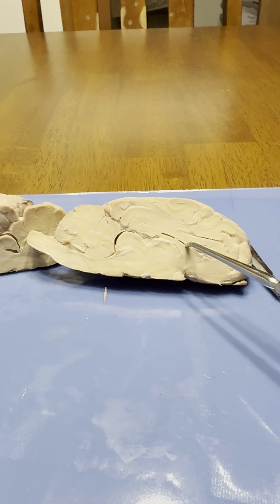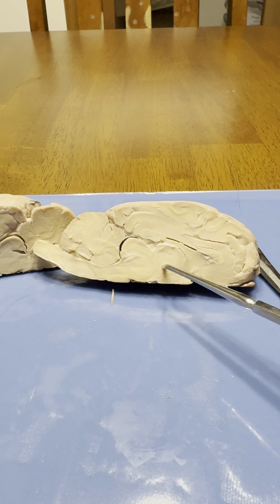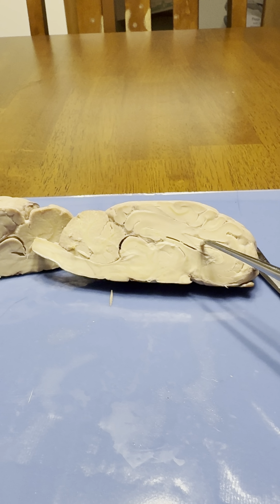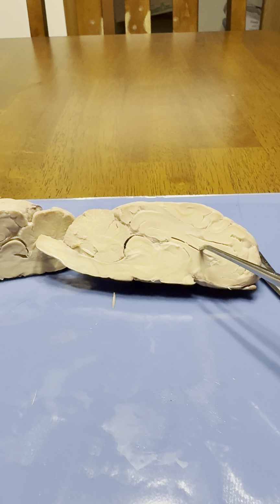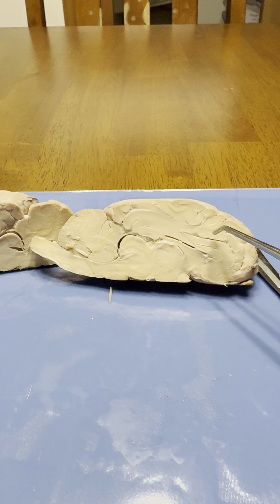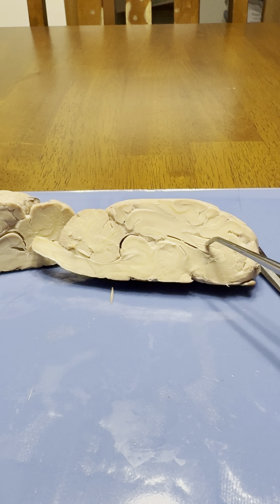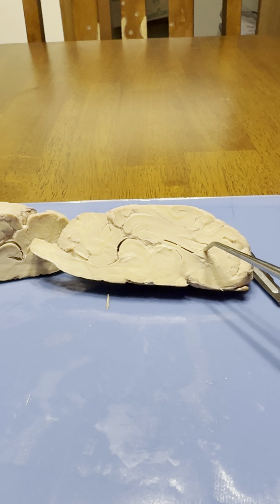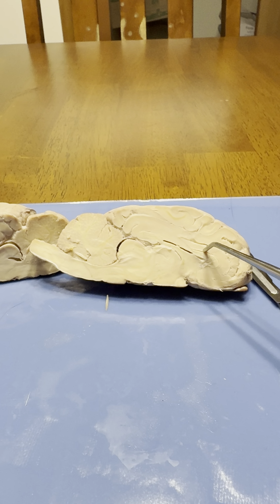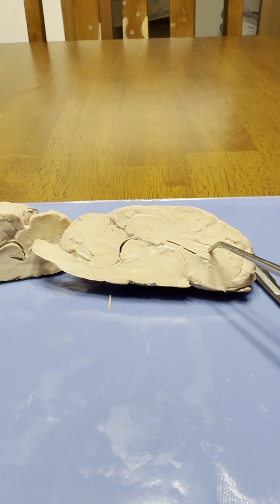And then above it, right here, you have the gyrus, which is one of the folds. And then right above it, right here, this line right here, is a sulcus, which is a groove between gyri of the brain.